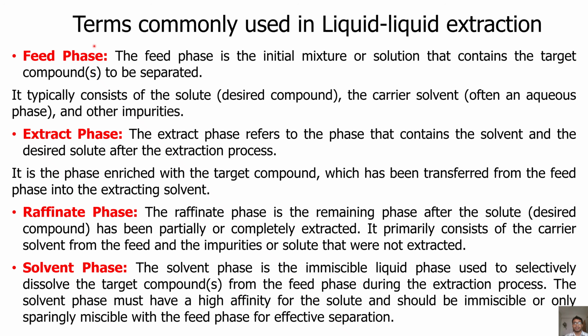Now let's learn commonly used terms in liquid extraction. First of all, feed phase. The feed phase is the initial mixture or solution that contains the target compound to be separated. It typically consists of the solute, the carrier solvent, and other impurities.